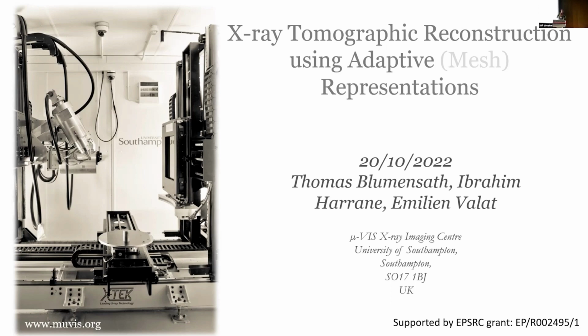And so last year I was standing exactly here talking about our software where we can reconstruct directly into a tetrahedral mesh basis in our X-ray imaging rather than have voxels. So today I want to talk a bit about tetrahedral basis, but as you can see, or not see, the mesh, which was in the title, I made slightly less prominent, because I'm going to talk more generally about how to represent the image that we're reconstructing in an X-ray tomography problem, and what are the different bases that we have and what can we do with them afterwards.